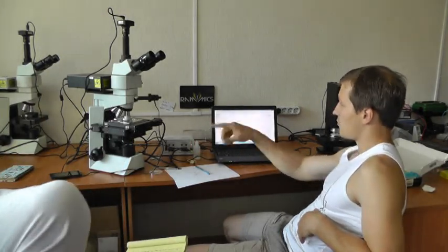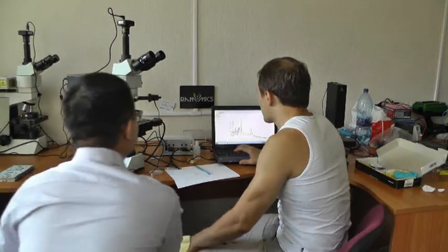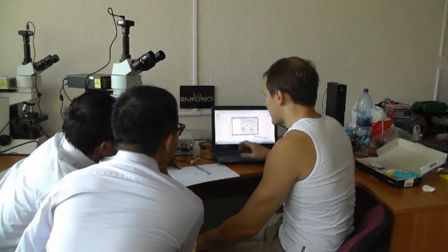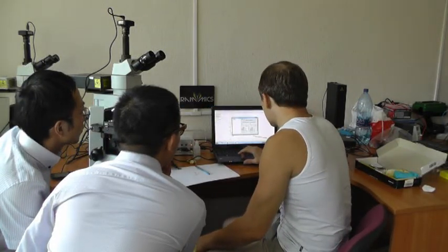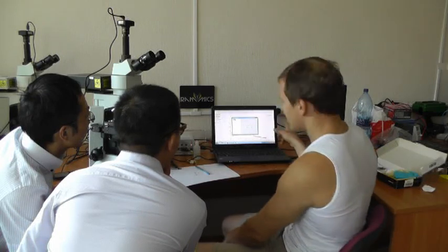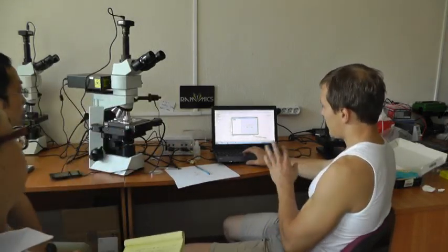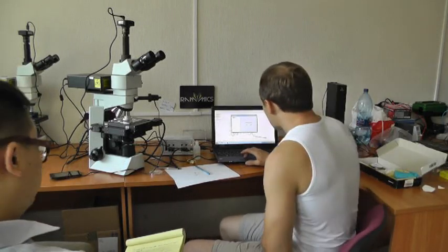And the software used for both devices is all the same. We only need to choose in these two settings the scanner device. It is either standard, V6XY station called standard, and alternatively we could choose servo. It is called servo because it is controlled by two servo motors. Okay. The rest of the software is all the same for both devices.